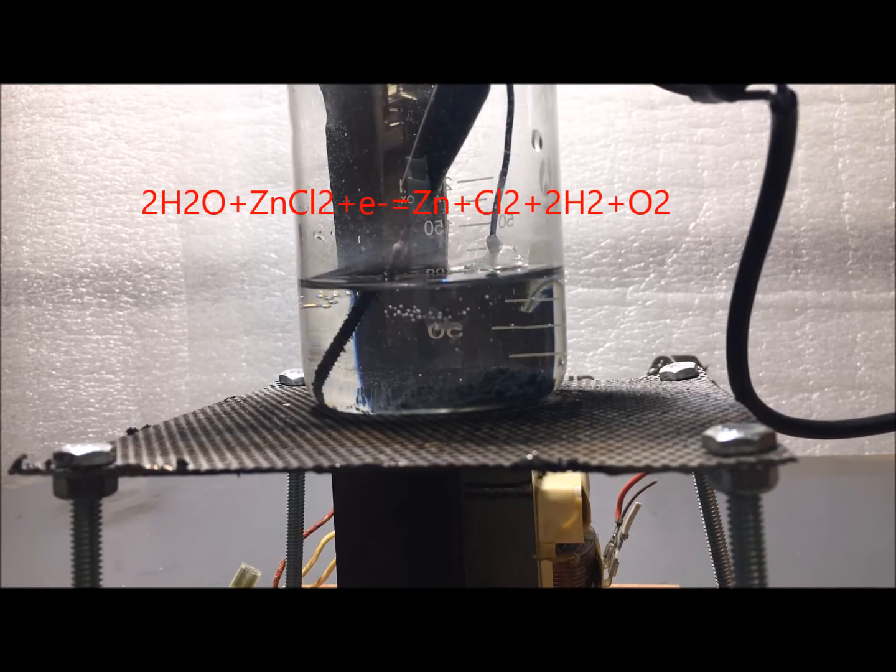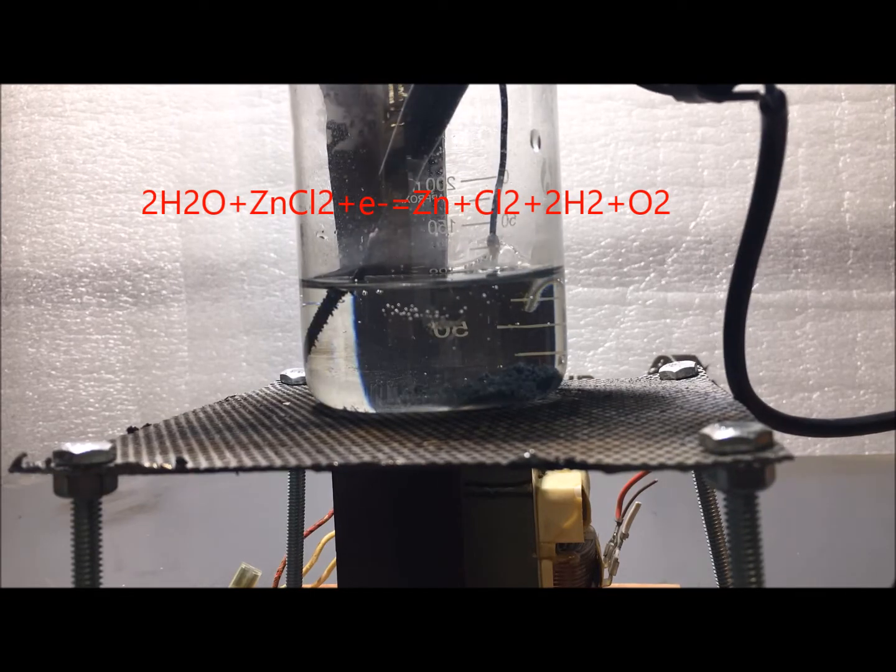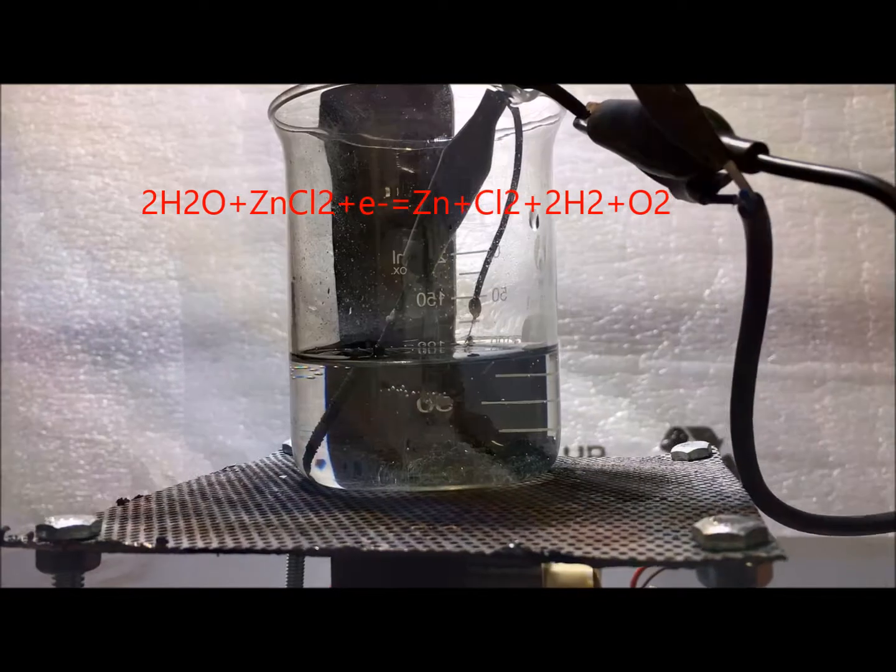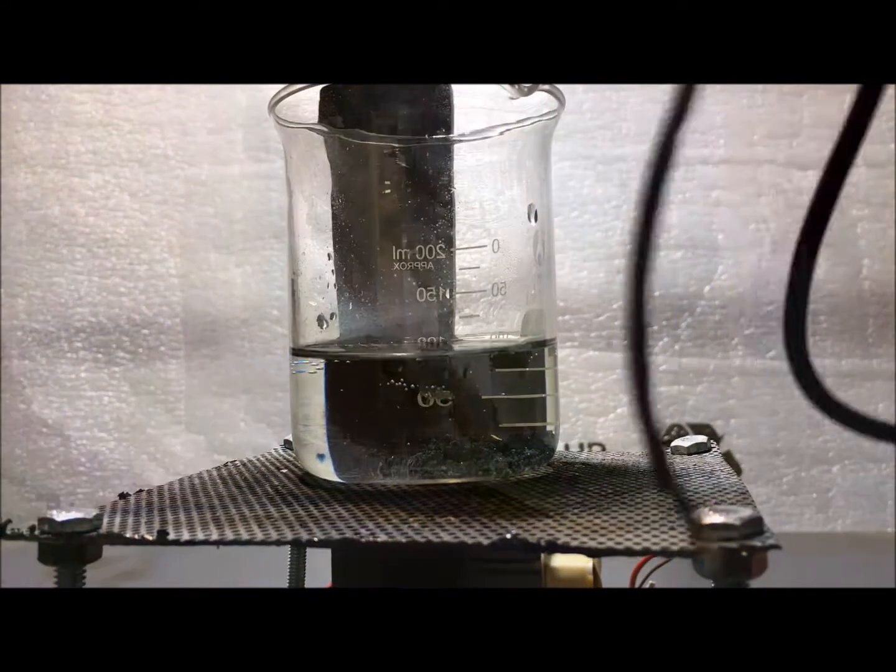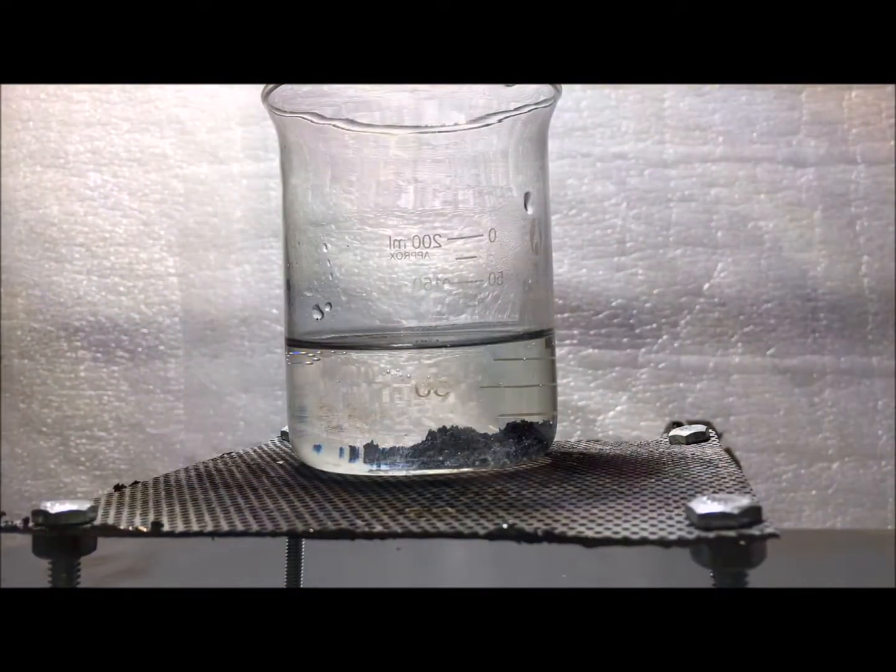The cathode is simply a carbon rod. Once the power is applied, you will see bubbles on both electrodes. The anode is producing toxic chlorine gas, while the cathode is producing hydrogen gas and zinc metal. You might want to do this outside.